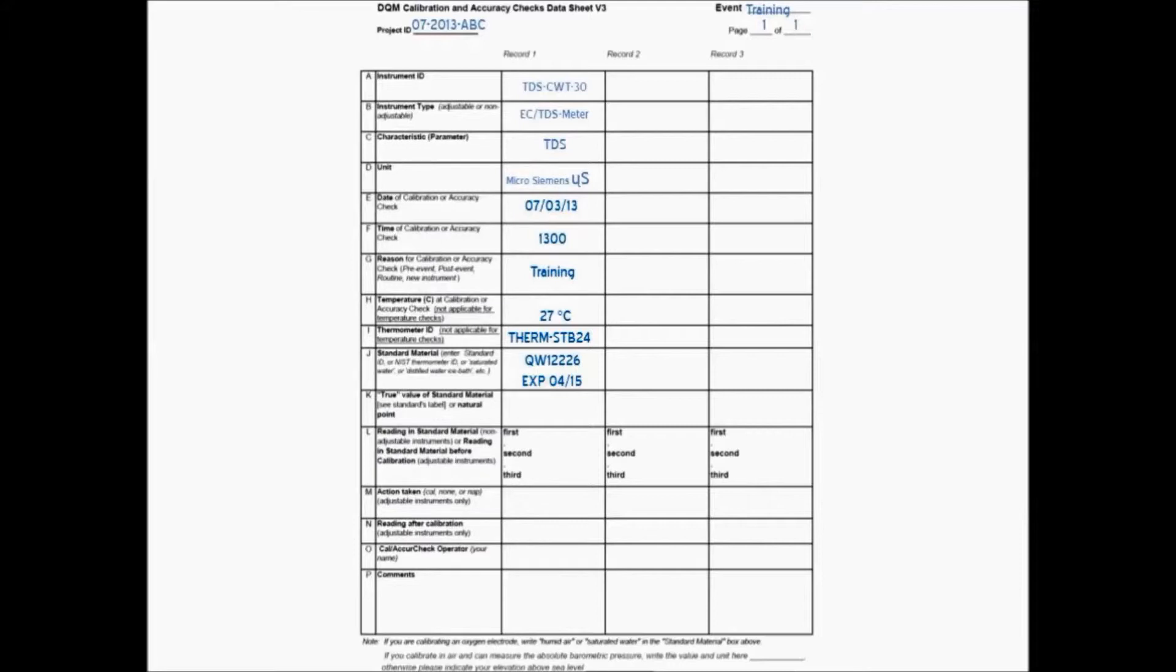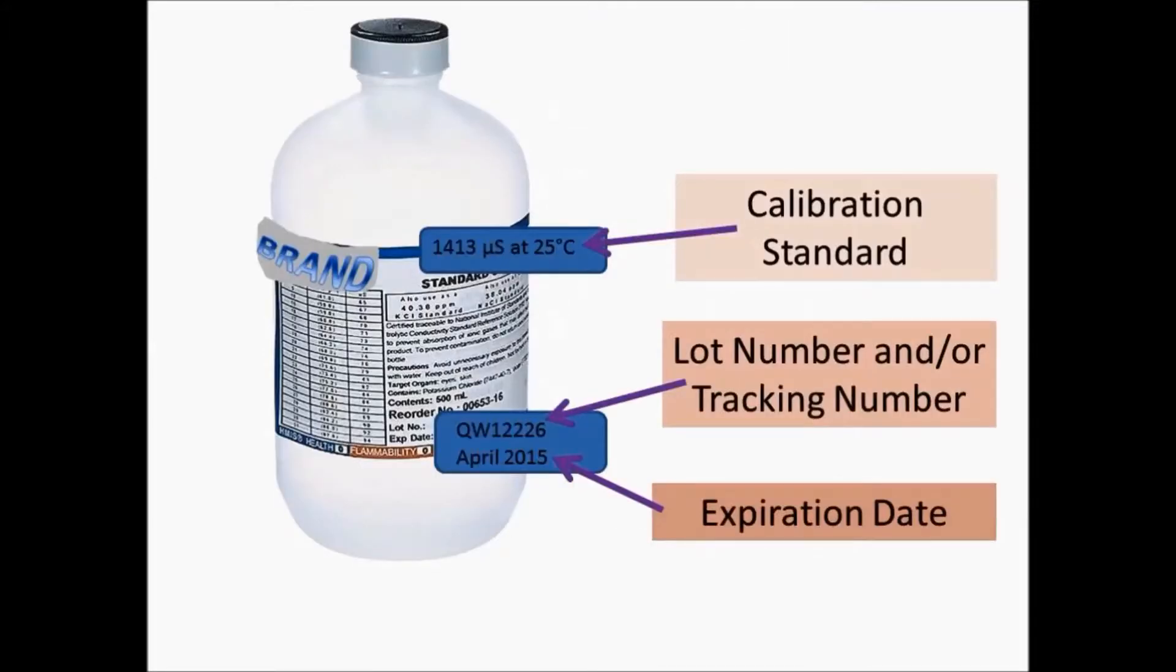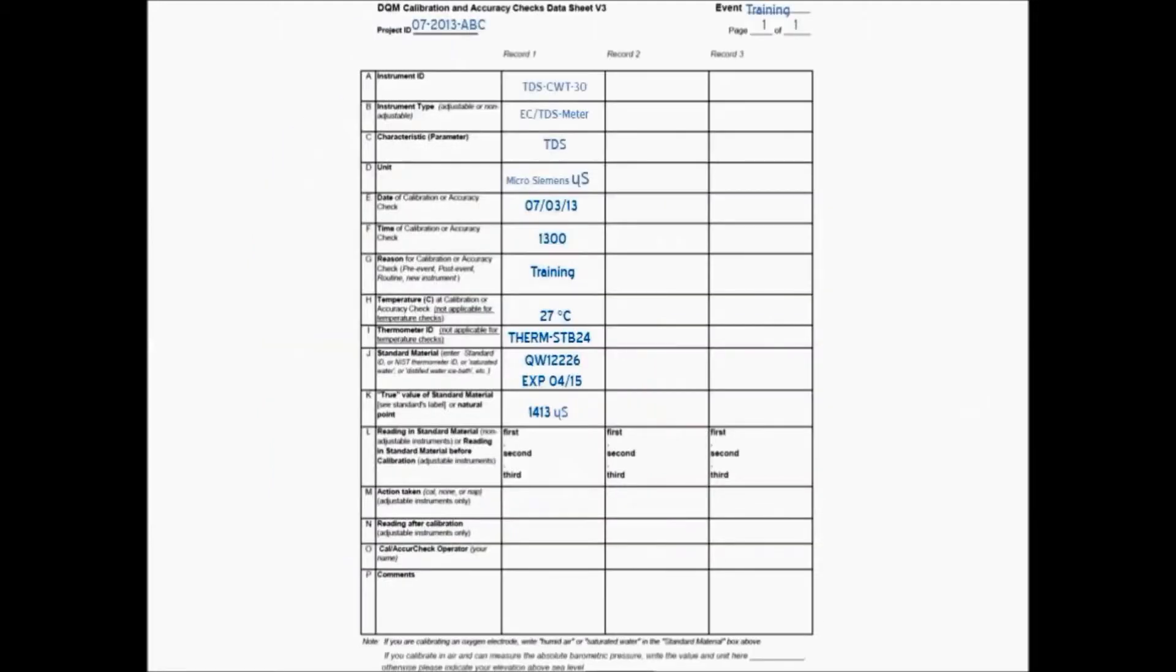The true value of our standard material, in this instance, is 1413 microsiemens.